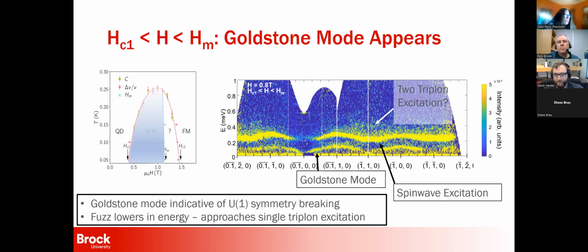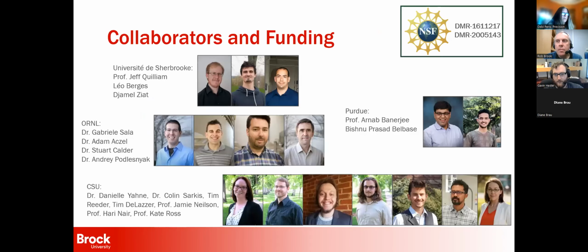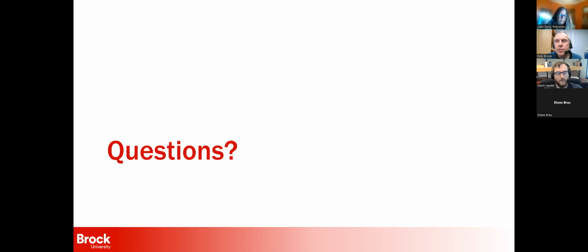What is the maximum and minimum sample size that the system can index? I think, Rob, this might be for you. Oh, yeah. In terms of the smallest, we're using a microfocus X-ray source. The smallest one I've done is about 50 microns across. The largest standard system can probably accommodate a sample about 200 to 250 millimeters across, but we could make a bigger system than that.